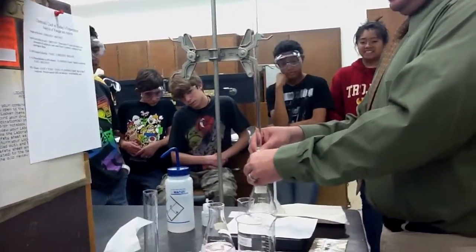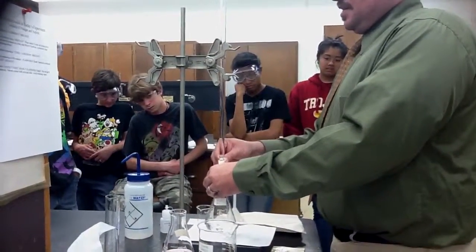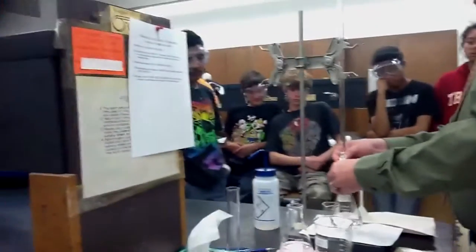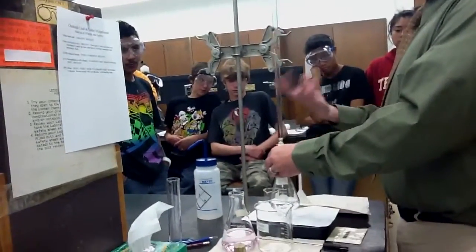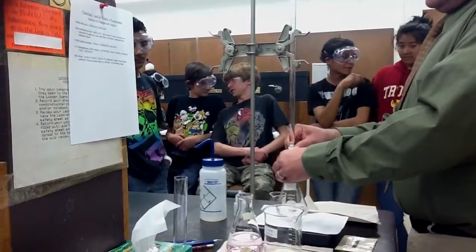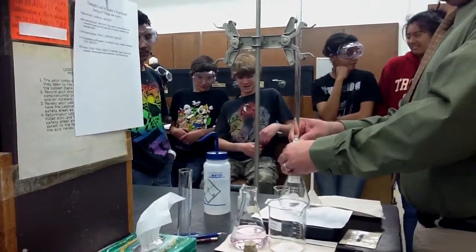So now, you see here that it's starting to take longer to turn pink, right? So then you can start to get rid of some of the acid. As Dave's mentioning, it's a weak acid, it's reversible. That means you get the acetic acid back again, but the sodium hydroxide consumes all those protons, and at the end, you should have hardly any of the acid left over.